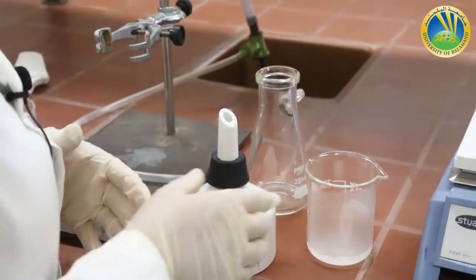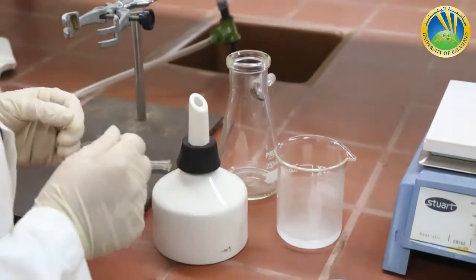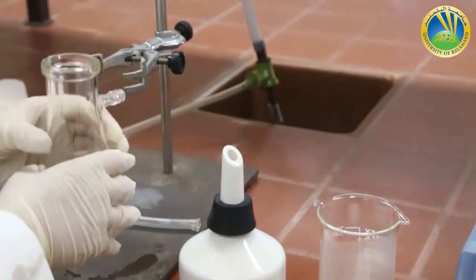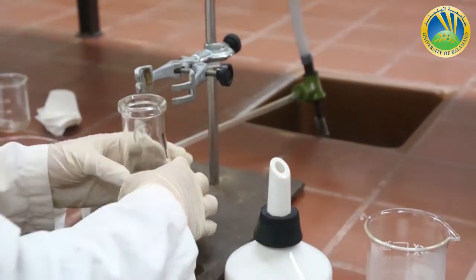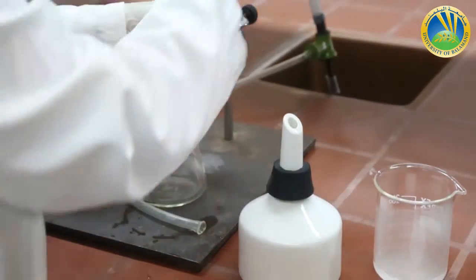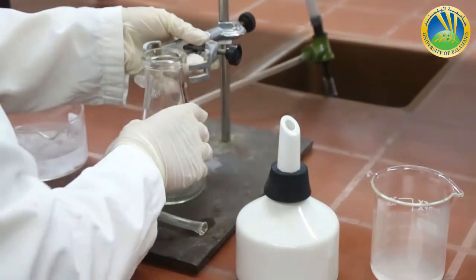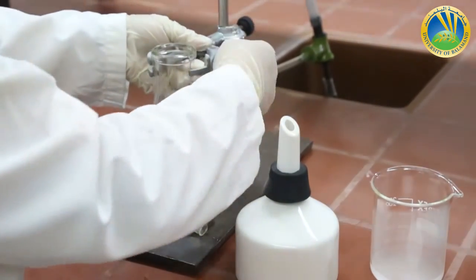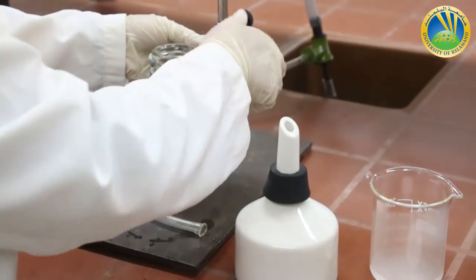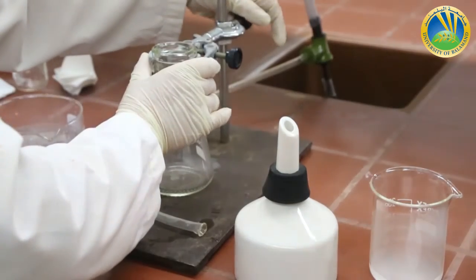While waiting for the crystals to form and to have a very nice shape, I will install the Buchner filter or the vacuum filter. I have to fix well my Erlenmeyer flask to avoid any damages. I hold it well with the iron clamp, then I fix the iron clamp on the support.